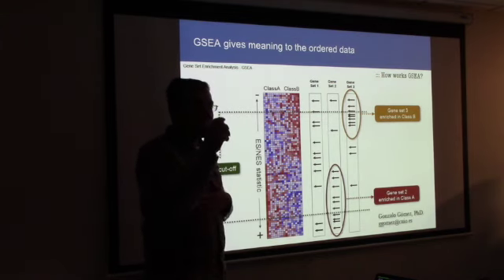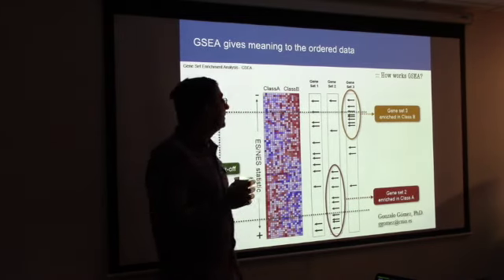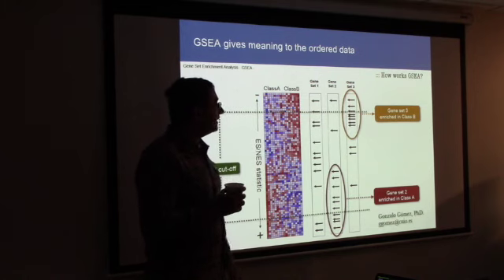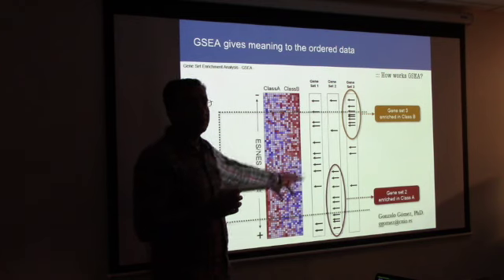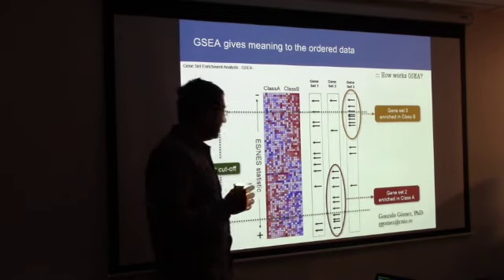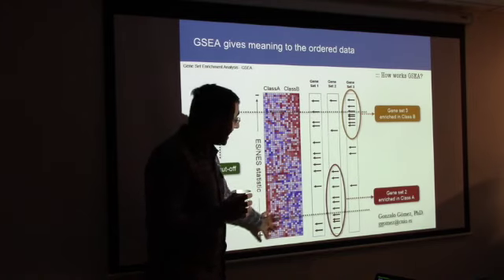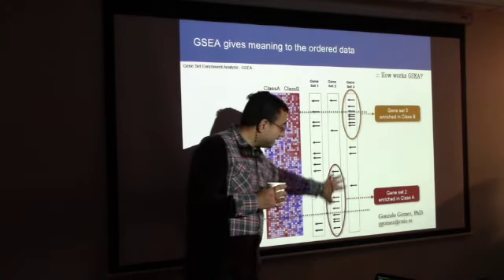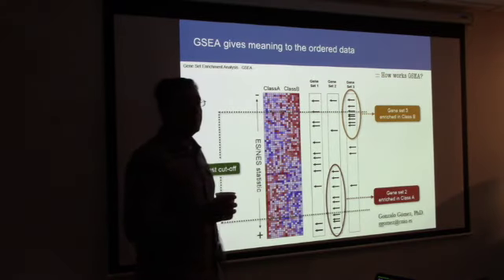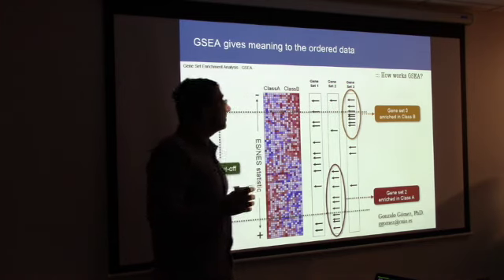It's a lot of genes that are overexpressed in the class A group. In gene set 1? Oh, sorry, I was looking at 2. Yeah, so if you look at gene set 1, it's kind of scattered, right? It's everywhere, you don't see any particular pattern here. But then let's look at gene set 2, and as you said, you're right, what you find is that all the genes that are upregulated in class A seem to also concordantly appear in gene set 2. Not so much here in class B, the genes that are upregulated in class B.